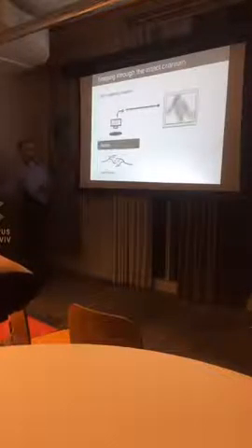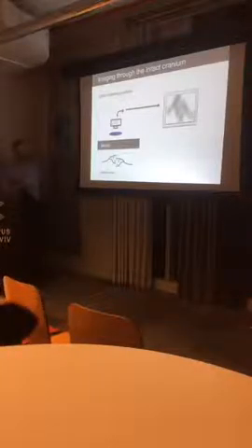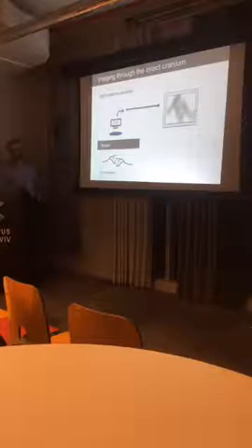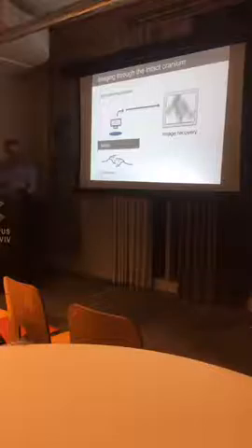Because we have a problem with the optics. If there is tissue and we want to see blood vessels, it's hard to see them because we have scattering. We cannot get this information as clearly if we use, for example, a standard thin slice. So the goal is to use some specific techniques in order to recover the image.